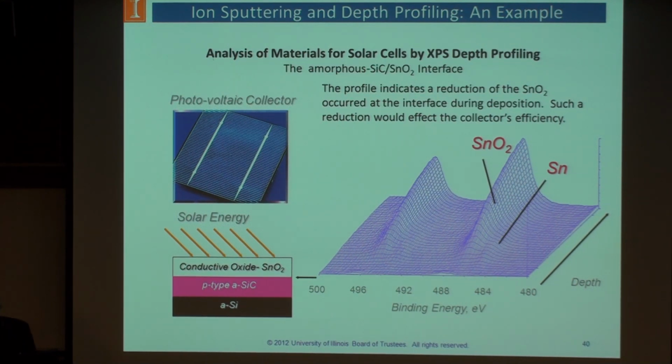And if you remember earlier, we're going to try to do sputtering with this. The ion sputtering process is quite damaging and physical, and it can also alter the chemistry of your material. It just turns out that if you sputter tin oxide, you will preferentially remove oxygen from it, but you cannot reduce the oxide all the way down to tin metal. So it will reduce from SnO2 to SnO. And so if we do see tin present at the interface, it was actually caused by the deposition process and not the sputtering. As you can see, as we go into the material, we do in fact see a little bit of tin present right at the interface, which is right about here. And then to confirm that we're not damaging the tin or producing the tin by the sputtering process, we'll go further into the tin oxide and see that it actually disappears. So we did get a little bit of tin production at the interface through the deposition process.